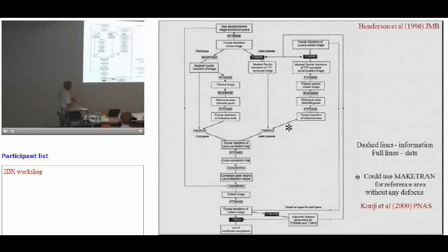and then we had a program for searching this map of cross-correlation peaks called quad search, which gives you then a list of all the unit cells in your image, and that list is described in terms of deviations from the lattice that you'd indexed in the initial indexing up here. And then the original image is reinterpolated, unbent if you like, to make all the unit cells agree perfectly with that originally indexed lattice.